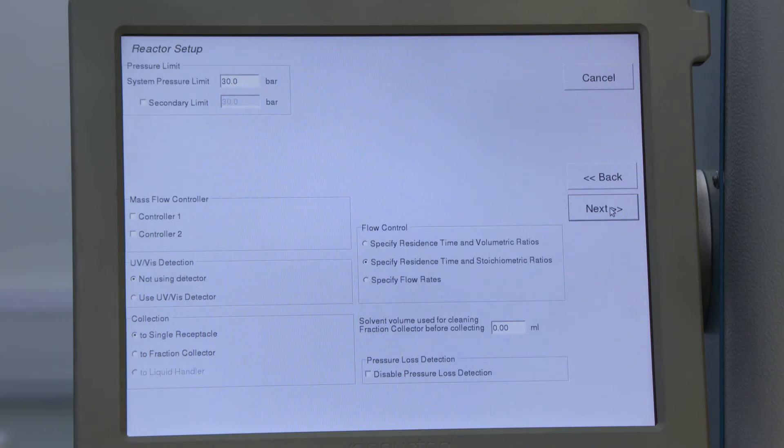On this screen I get to set up some other parameters like the maximum pressure that the system's allowed to reach, whether or not I'm using any auxiliary equipment, and how I want the system to be controlled by the volumetric ratios, stoichiometric ratios, and residence time.